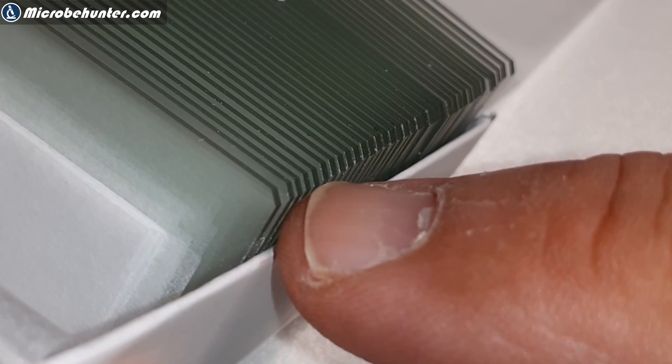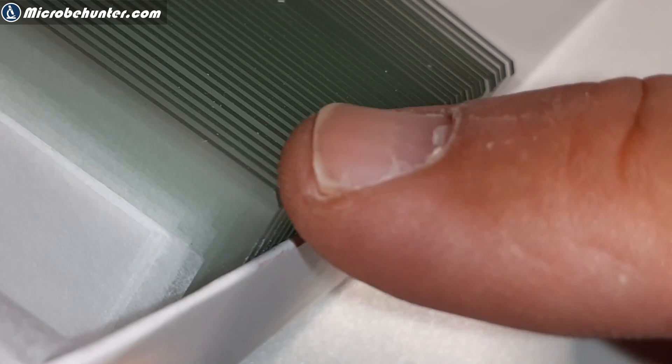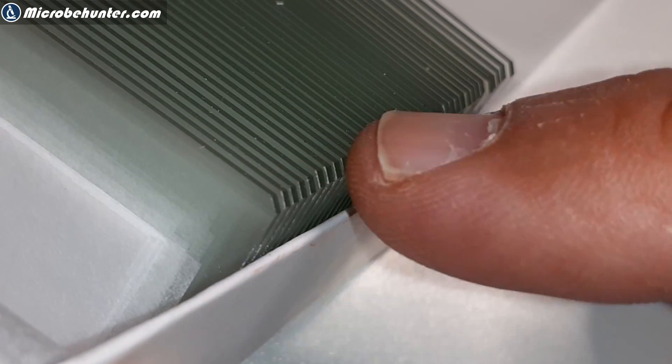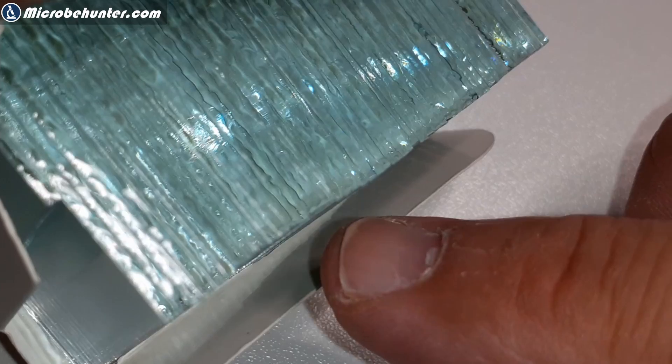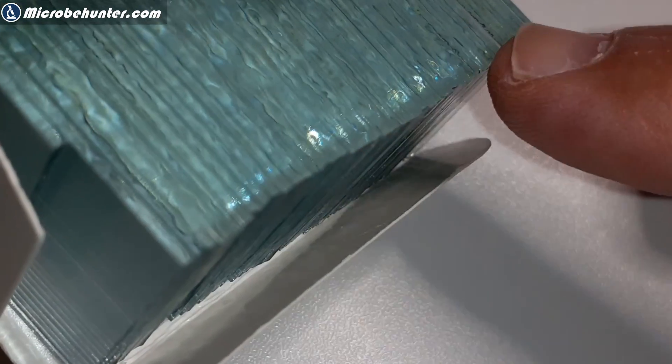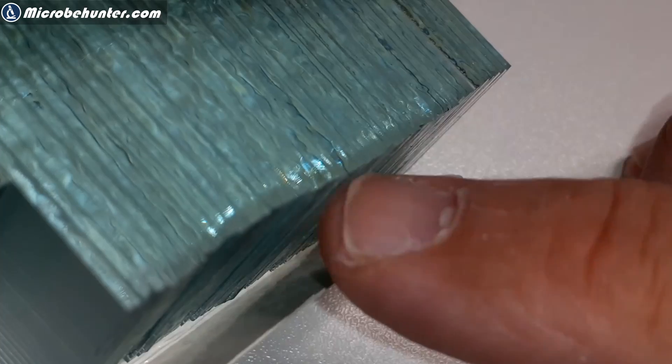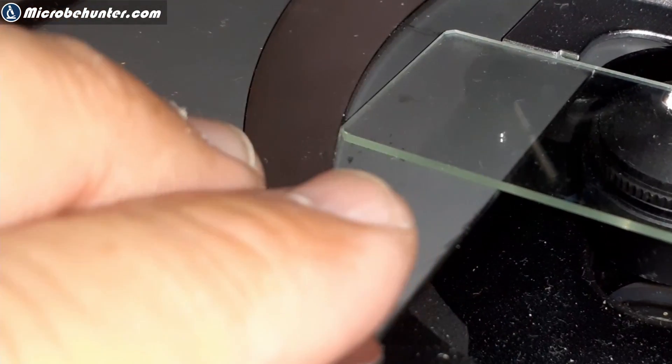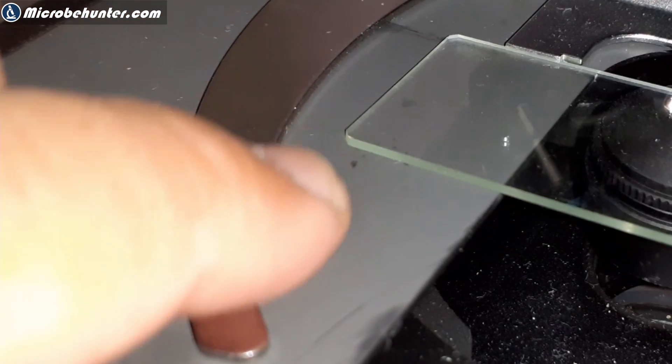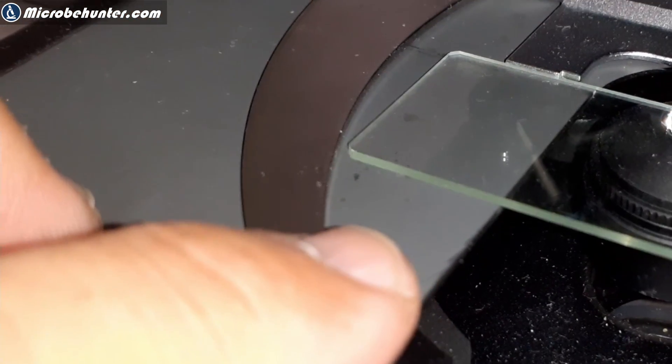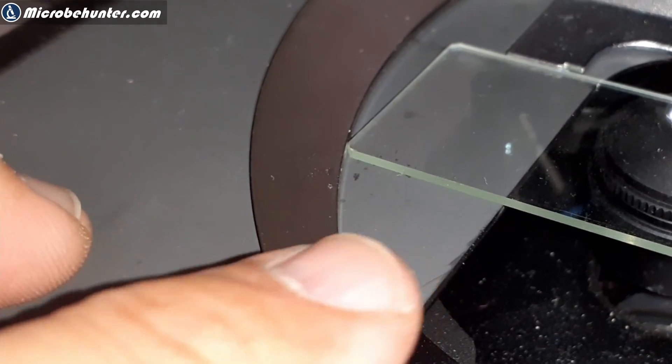When you look at the slides in a pack like over here, you can actually see much better that the corners have 45 degrees. The slides come in all sorts of variations. Some slides have those 45-degree corners and others do not. Some have ground edges, others do not. Some have frosted sides, others do not. The variations are wide. Those 45-degree corners can be an advantage when putting the slide into the slide holder on the stage because this also helps prevent chipping a little bit.